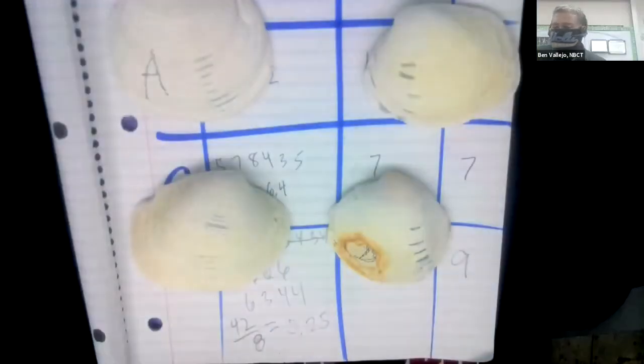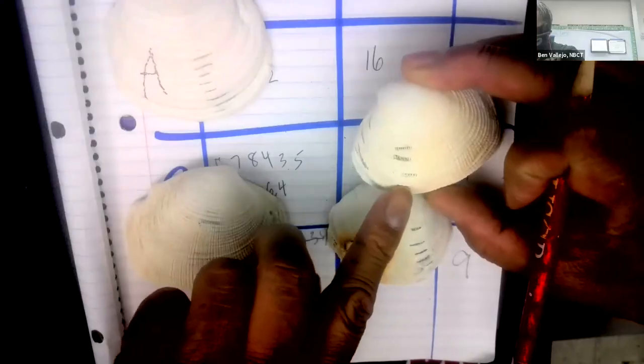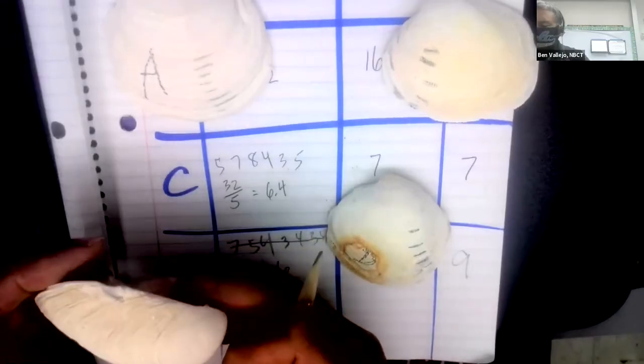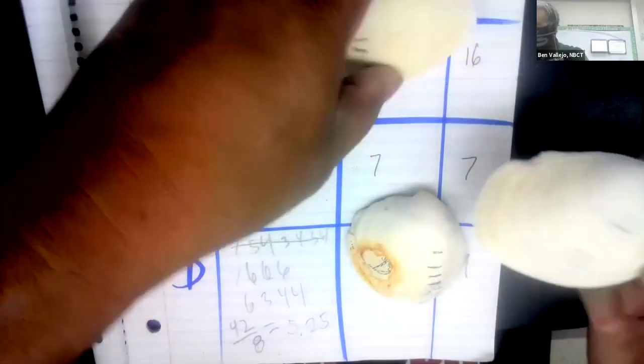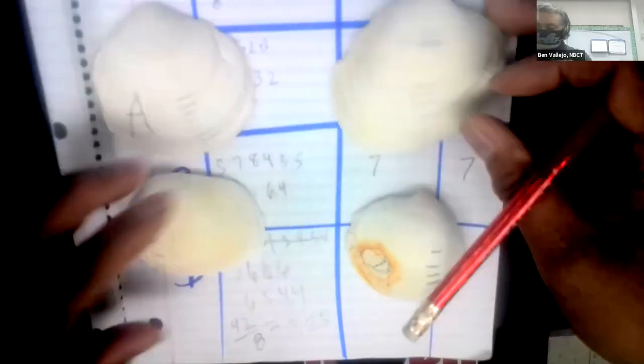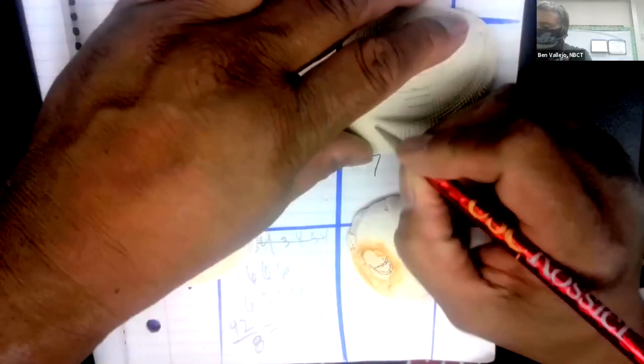I should have done this at the beginning. So we'll make that shell A. And then what's this one? 1, 2, 3, 4, 5, 6, 7. And this one was 1, 2, 3, 4, 5, 6, 7. They're both 7. So, oh, this must have been the 16. Okay, so that's C, and this one here is B.